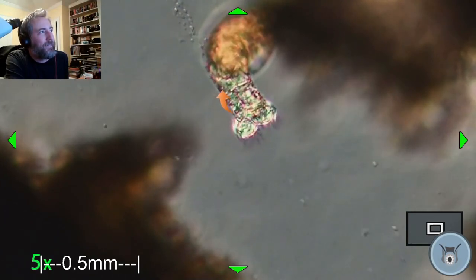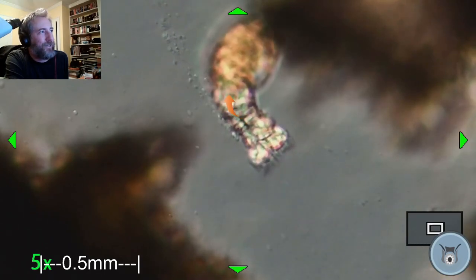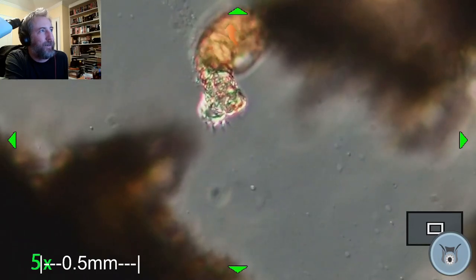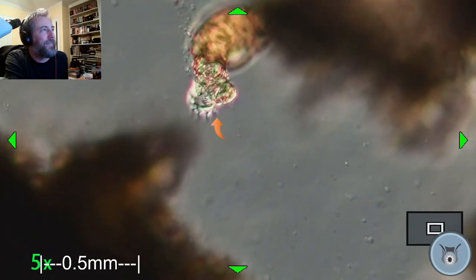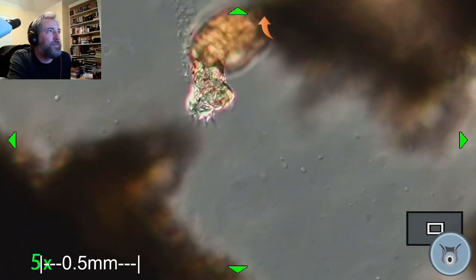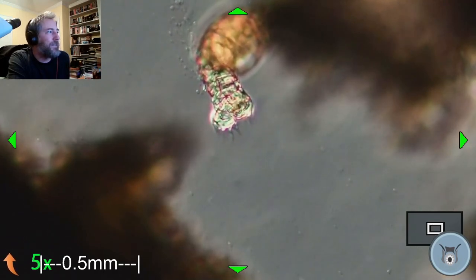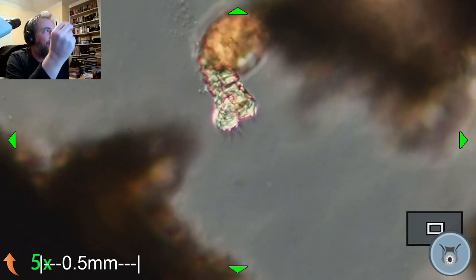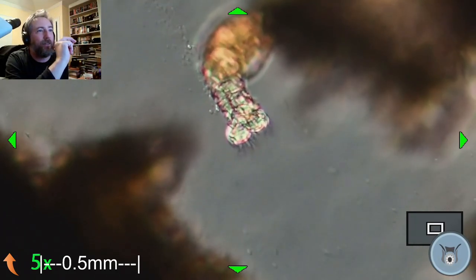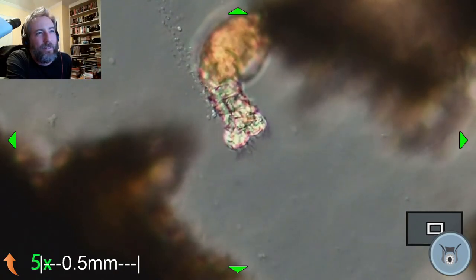And then it's got a mouth-like structure in here in the middle that it uses to chew. And then its stomach is back here somewhere, and it's got a little heart. It's a tiny animal. And then at the very back end of these things, they usually have a toe with three little claws, and it's holding on with the three little claws. So yeah, like a tiny Roomba.